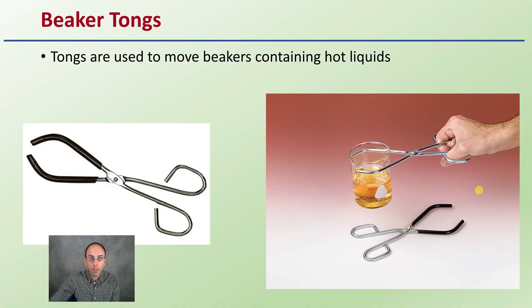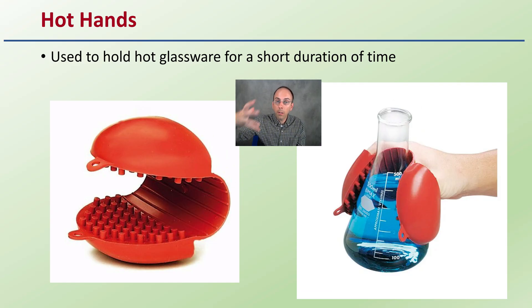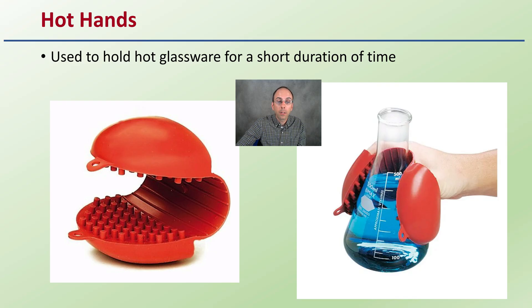Beaker tongs pick up beakers — no surprise there. Typically used when the beaker is very hot. They tend to be rubber-coated to reduce slippage. In addition to beaker tongs, hot hands is another option: slip your hands in and you're able to hold hot glassware for a short duration. They tend to be a little easier than the beaker tongs and the rubber grips hold quite well, again for short distances.